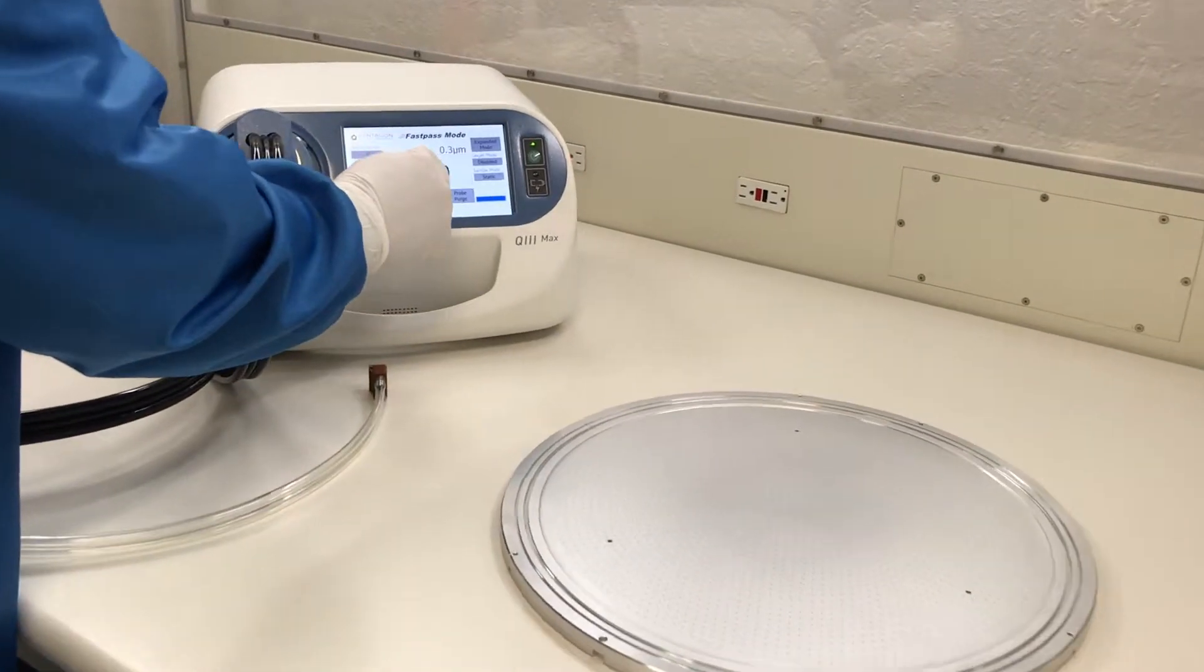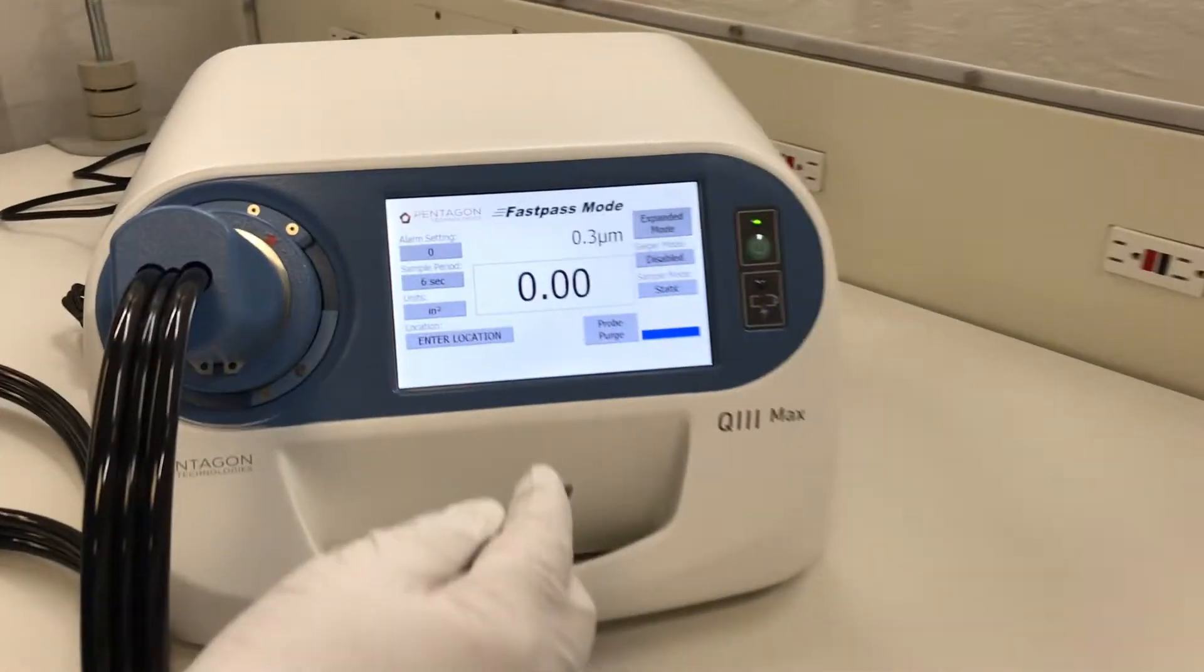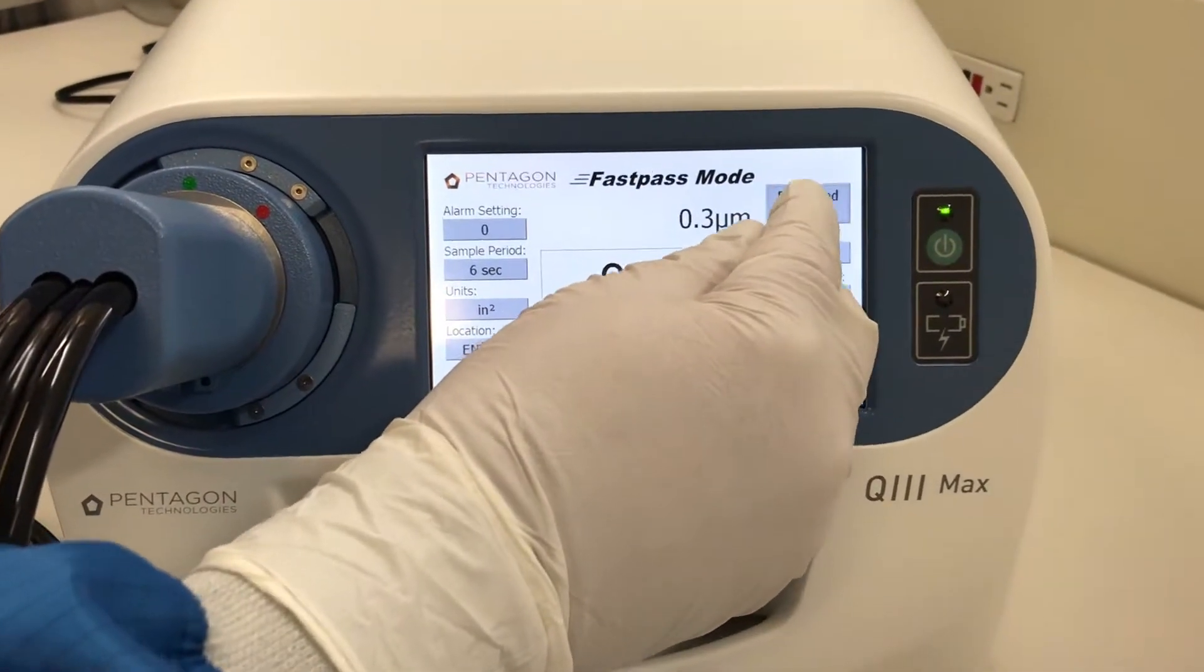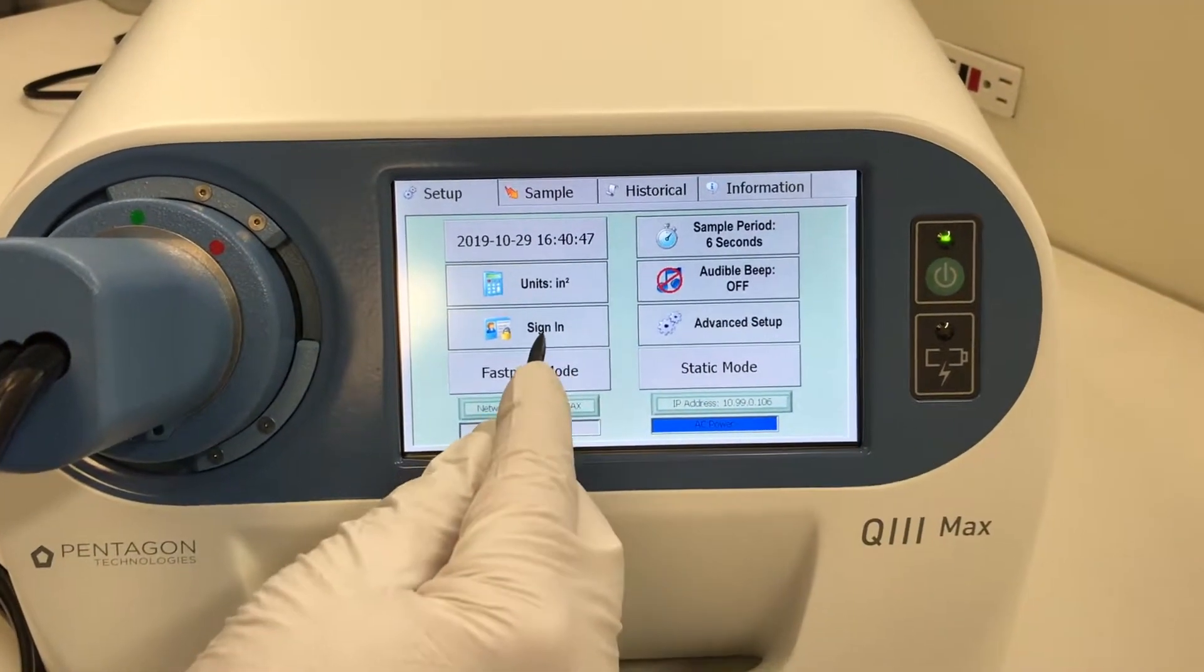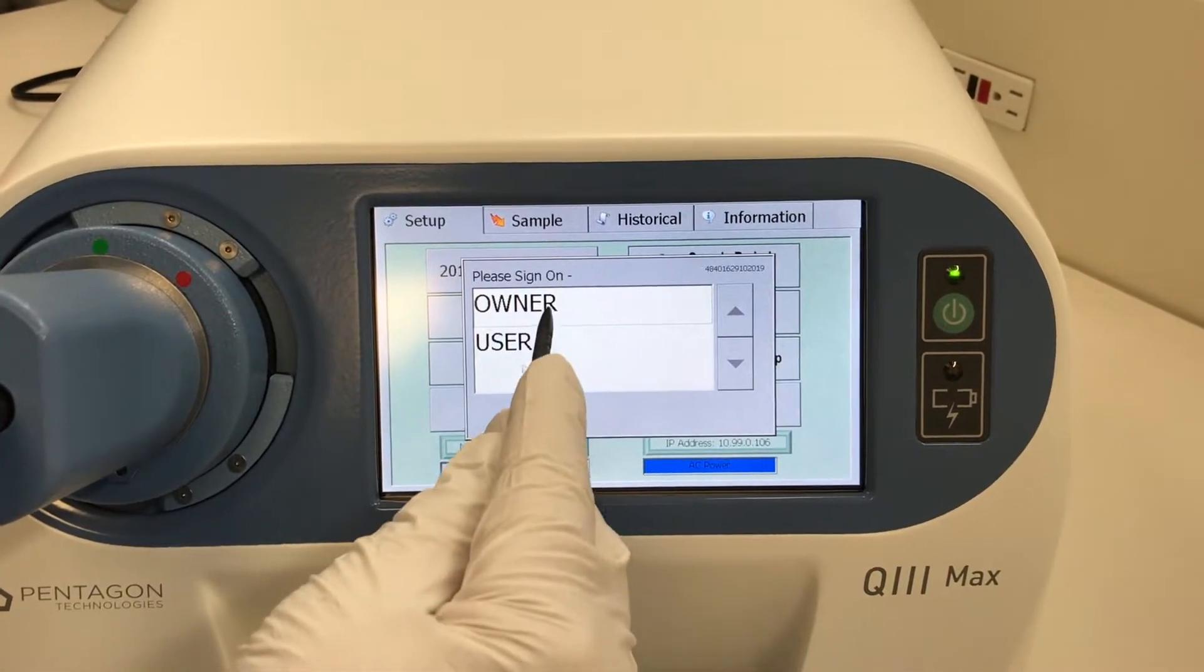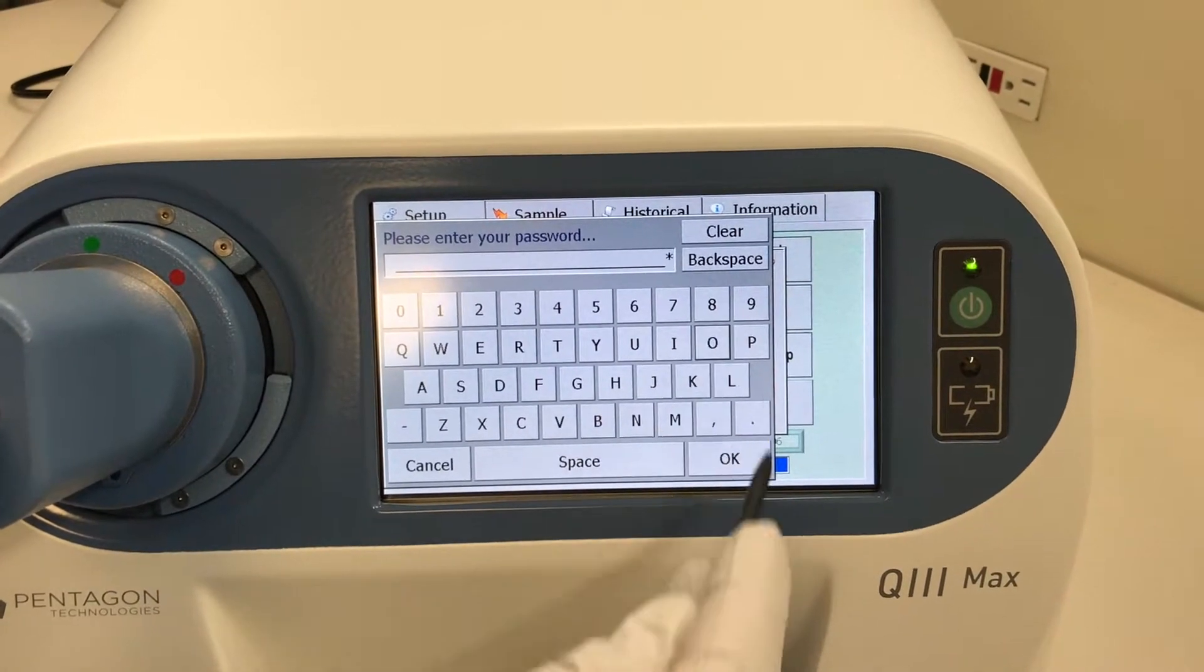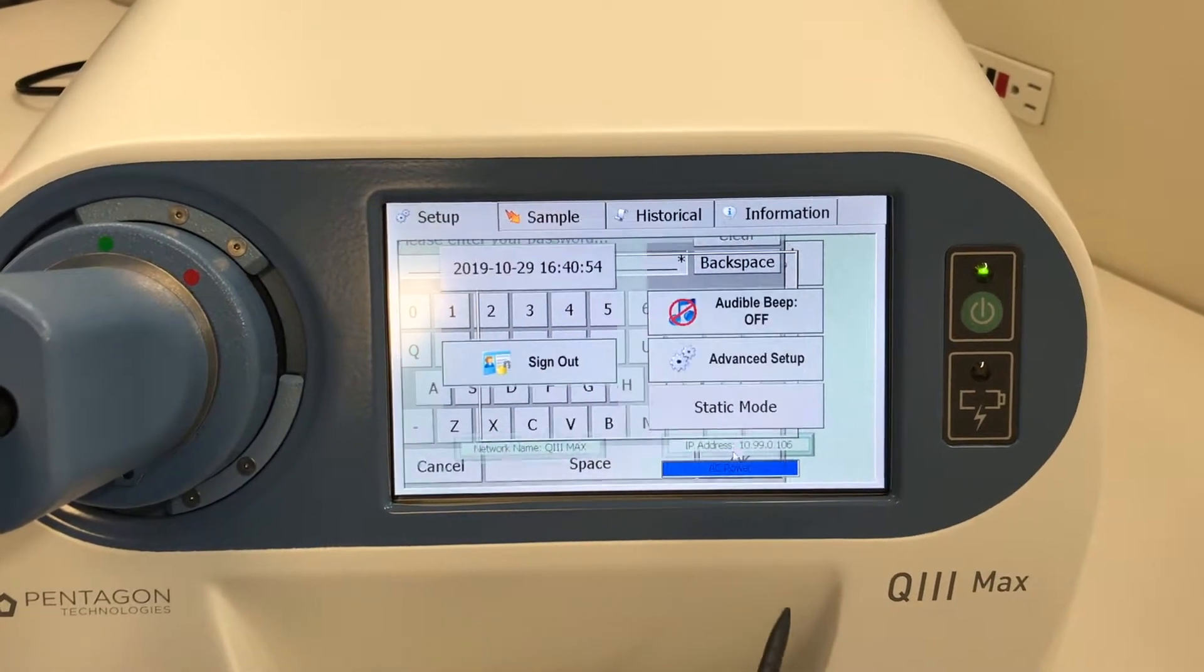The system is initializing, let's get ready to make a measurement. The system comes up in fast pass mode, however to see all six channels let's go to expanded mode and log in as owner with the default password of O.